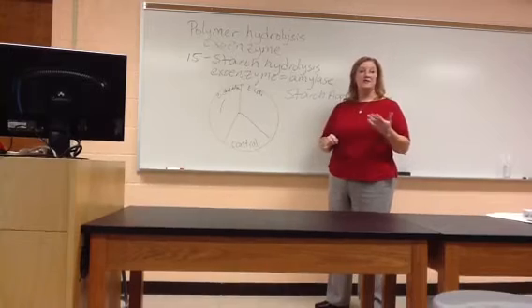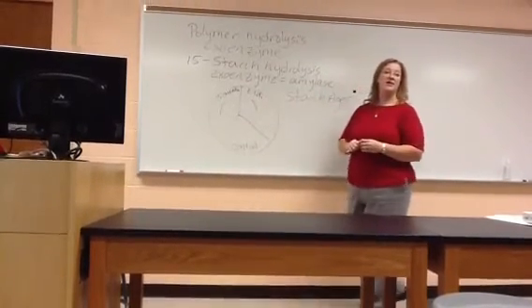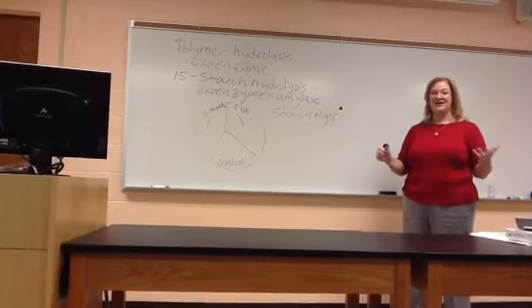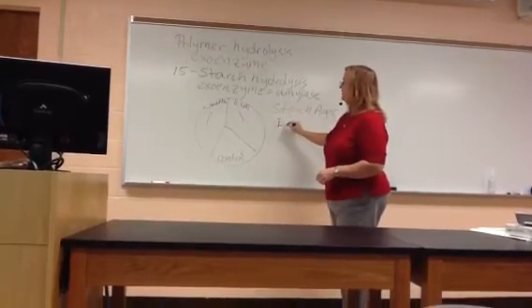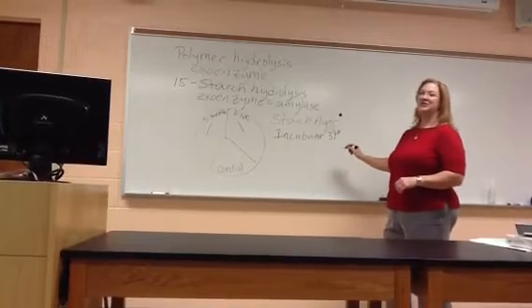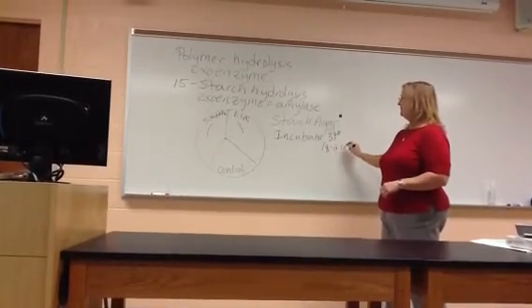Again, flame your loop, aseptic technique, put one small straight line of E. coli in the other section. And that's all you're doing today. Easy peasy. You're just inoculating them. And you're going to put them in the incubator. What temperature? 37 degrees. And how long? 15 to 20 minutes? Nope, that's autoclave. 18 to 24 hours.